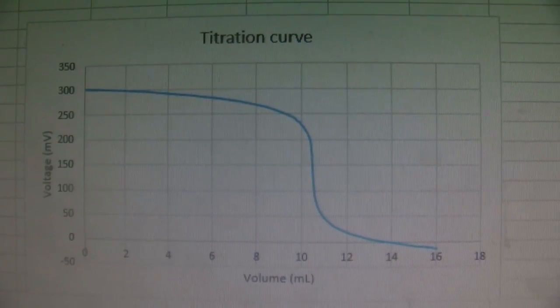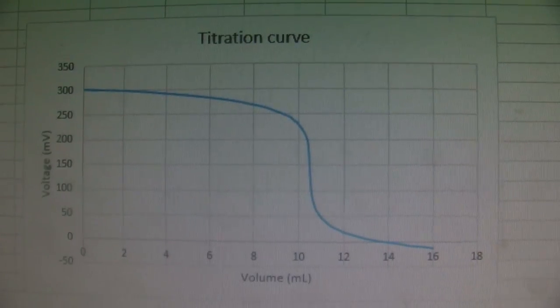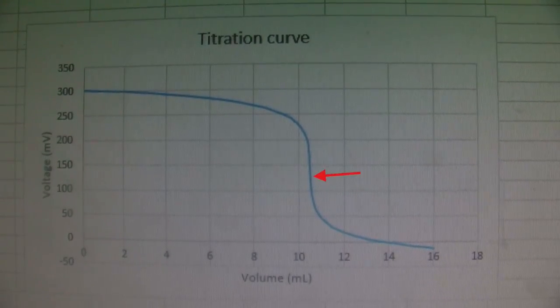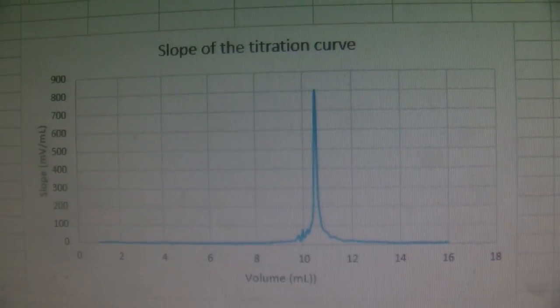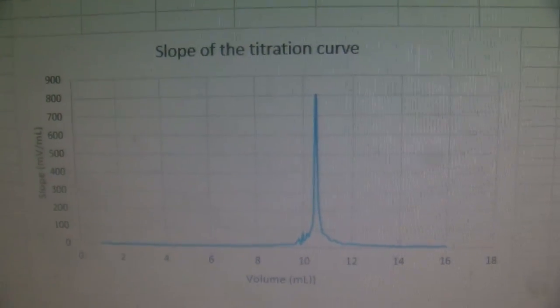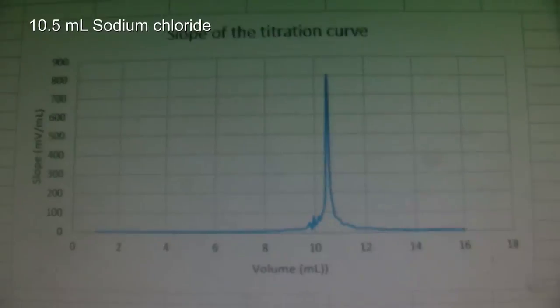Usually, a solution containing the halide ions is titrated with silver nitrate, so this curve is the other way around in comparison to literature. The equivalence point is at the point with the highest slope. When the slope and the volume are plotted, a distinct peak can be seen. This was at 10.5 milliliters, which could already be seen in the table.